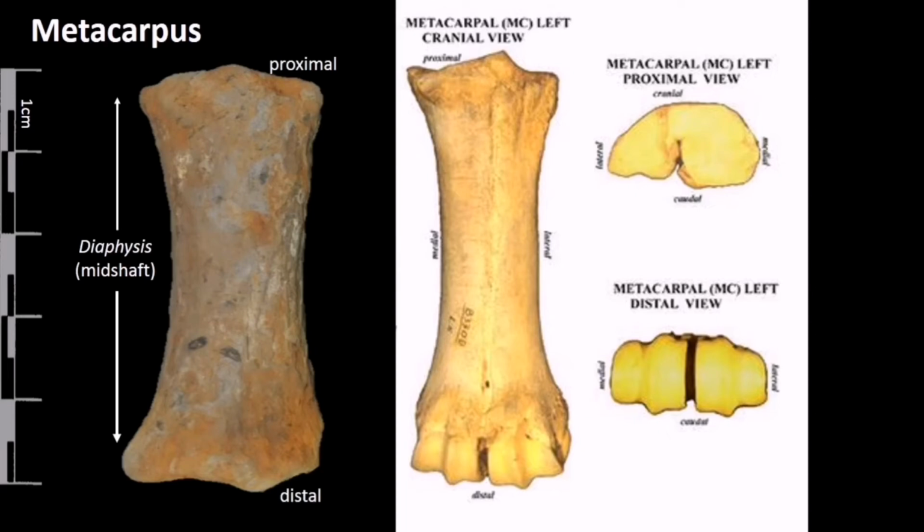So if we remove that, it will leave some ridges like the samples that I got. And the proximal looks just exactly like in the diagram. The dimensions of the metacarpus are in the following diagram. I'll provide you with the accurate dimensions and some comparisons between species.